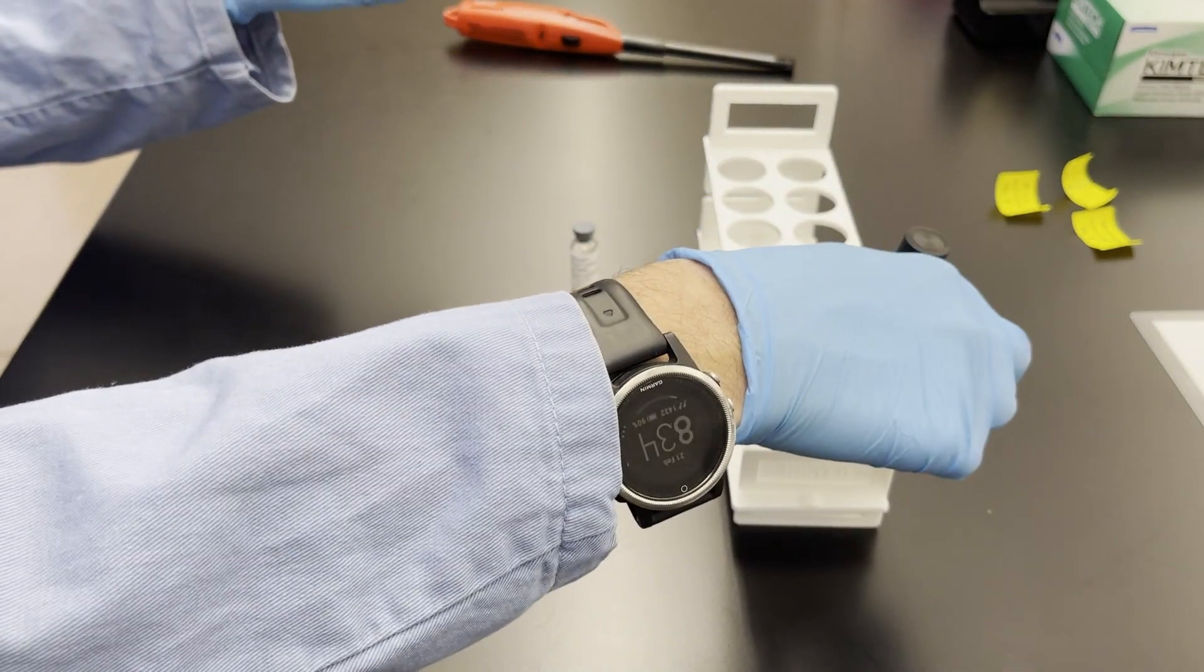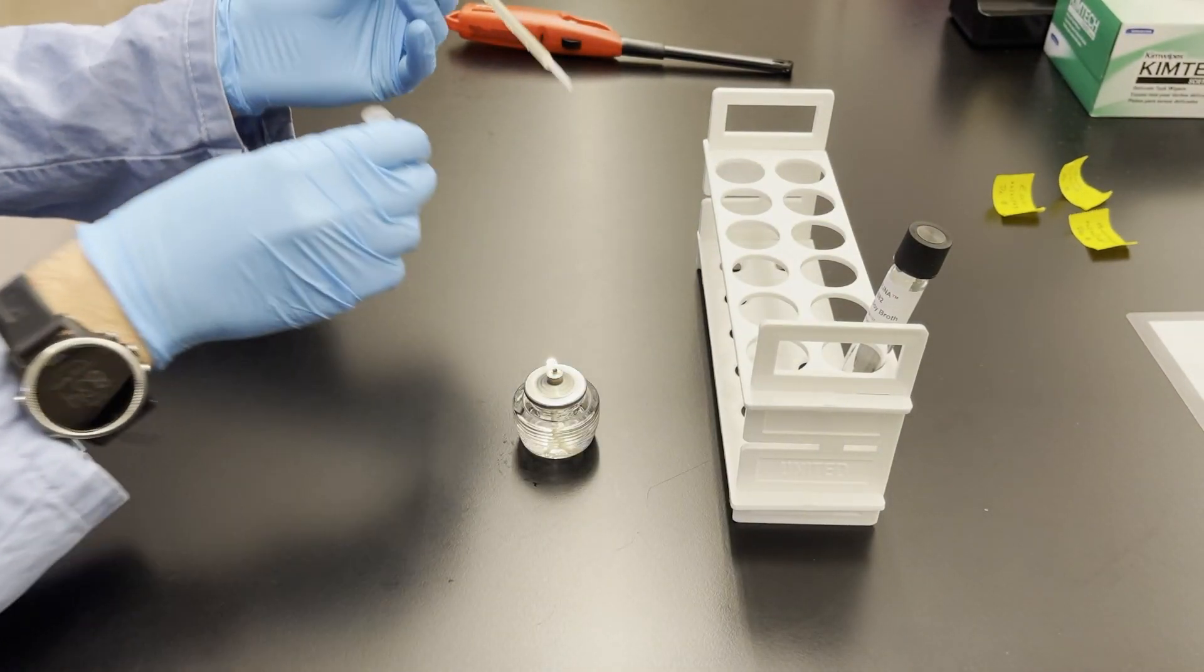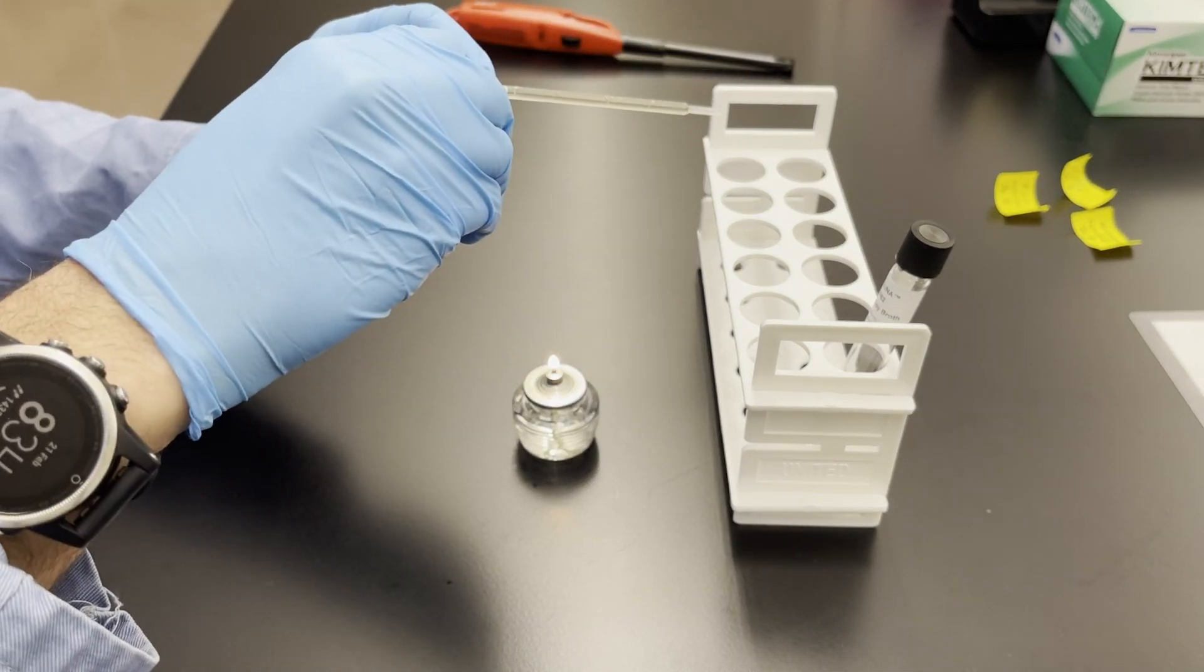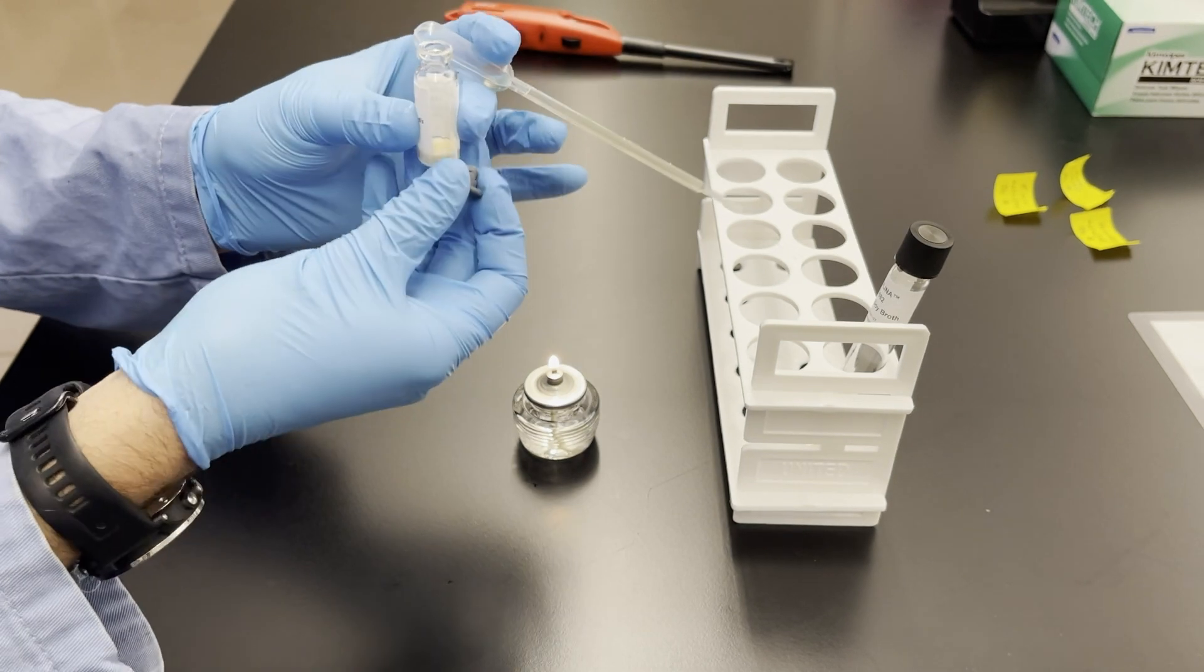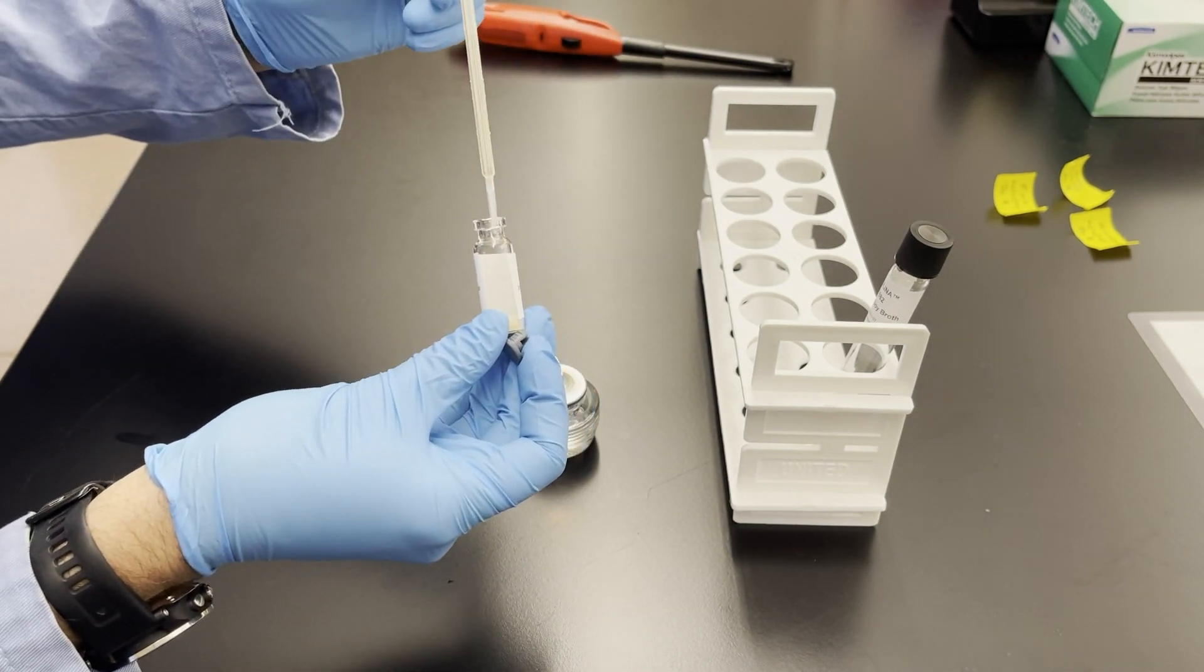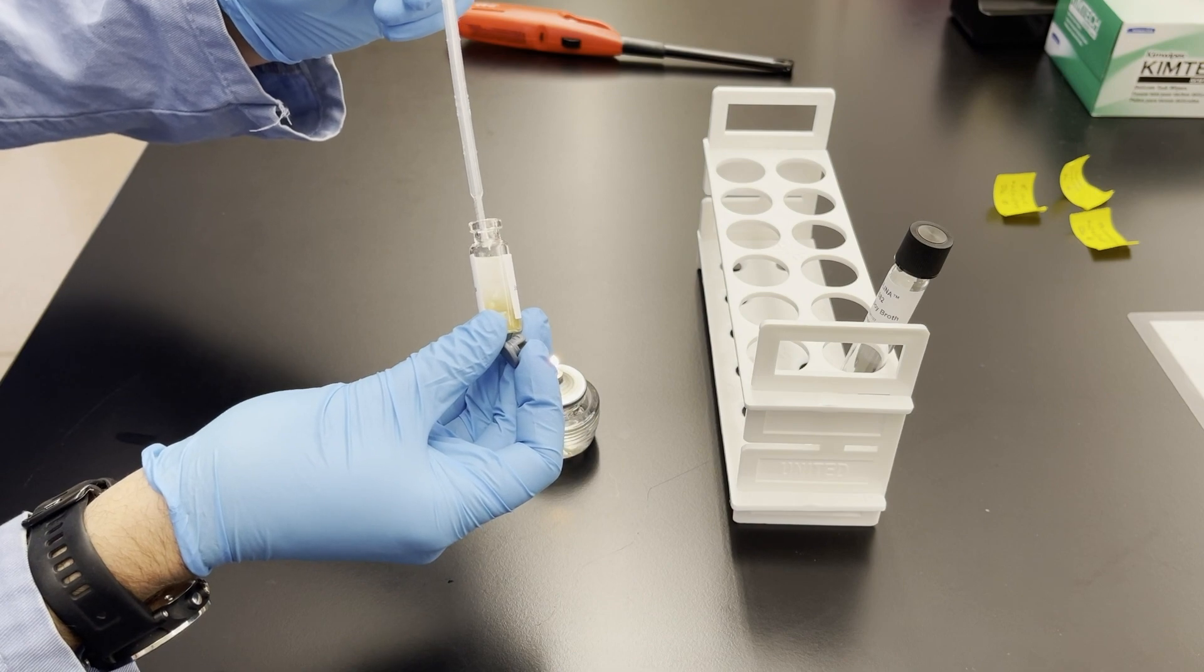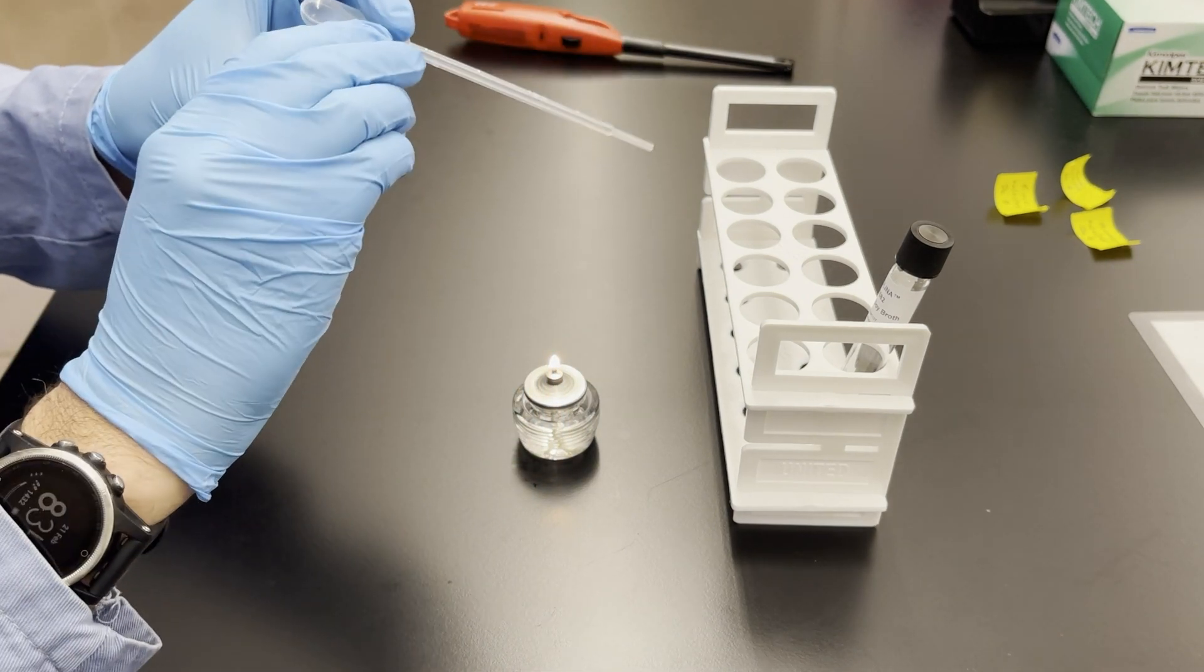And then before I close the tube I flame it again and then now I can open the rubber stopper and I'm going to place the broth that I have in the pipette into the freeze-dried bacteria.